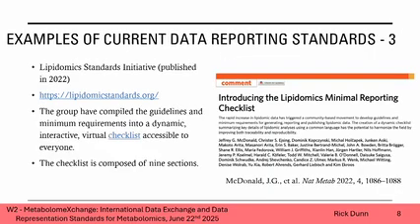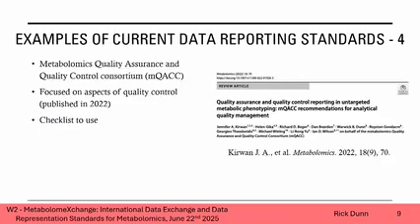And then along came, in 2022, the lipidomics minimal reporting checklist. There's been a lot of work before that, and I've been involved heavily in this as well. And this is really good. The others aren't online. This is an online portal, so it allows you to complete a virtual checklist as you go through, and you get a report at the end. That allows you to work through it in a semi-automated way. And I really like it. I think it's a way to go. But that's for lipidomics, so it's not talking about metabolomics. It's focused very much on lipidomics.